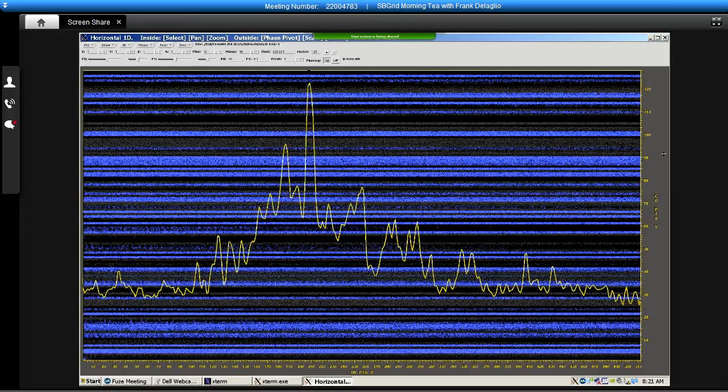We'll see more about how to phase or rephase already processed data. But at this point, we have the first 1D vector from the data. We have a reasonable phase correction.